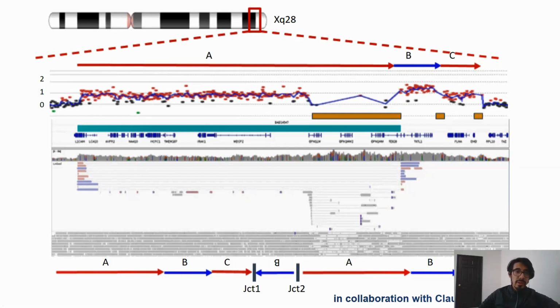So we can show you here that Sniffles 2 is a great aid in order to detect these very complex events. In the last part, we can show you how this is linearized, meaning how this is all connected in the genome. As you can see, these very complex events need not only one single technology, but multiple ones. And here we can show you that Sniffles 2 is able to aid greatly in the detection of structural variants.